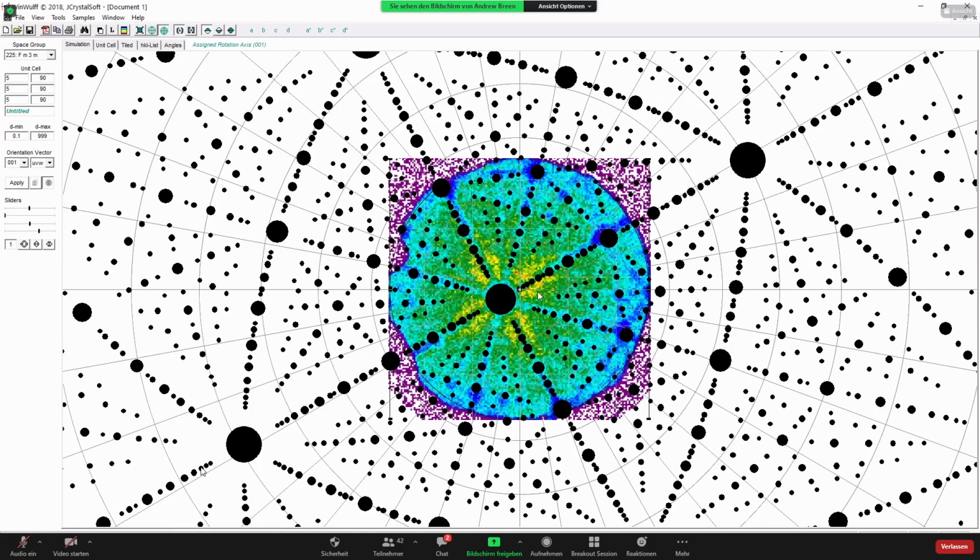But then I just make a note of what these poles are. So we've got our 001, but I'm going to change that to 002 to account for the plane spacing along that direction. This is 012, so you can read it off the top here. But I'm going to change that to 024 because for FCC, we've actually got half that plane spacing along that direction.